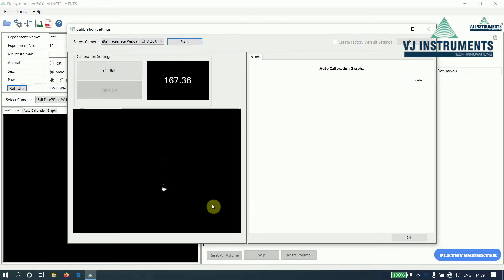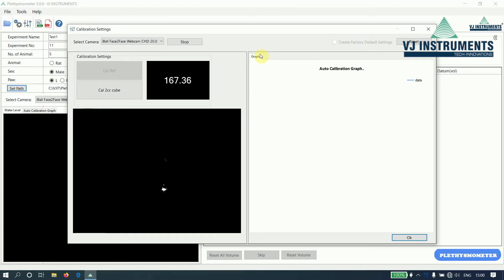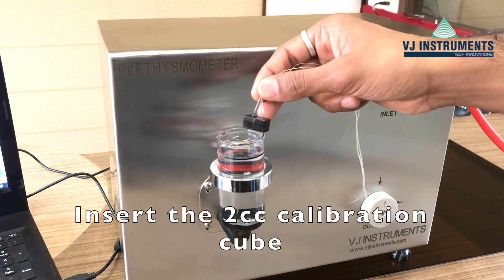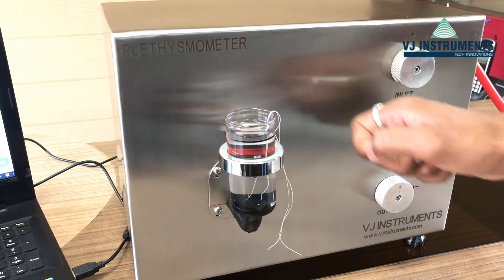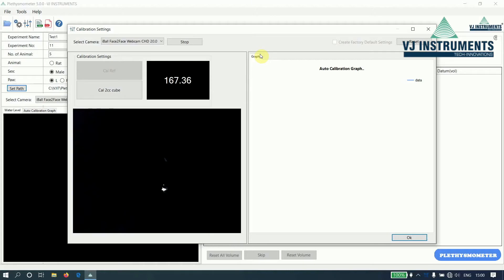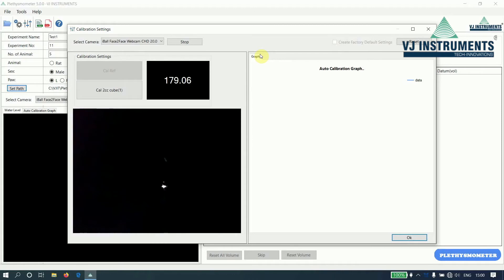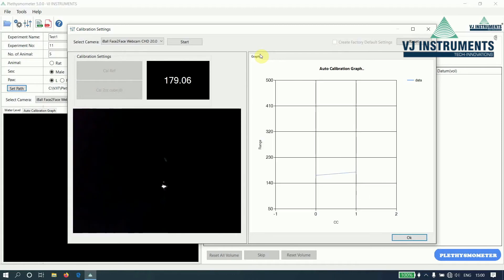Once we click on start, the bubble appears. And before inserting any cubes, click on the Cal Ref button. The cubes are provided by VJ Instruments. Let us now insert the 2CC cube. Once we insert the cube, the readings will be automatically locked after 10 seconds. The calibration settings is a one-time activity. We don't have to do it every time we open the application. Click on the OK button.